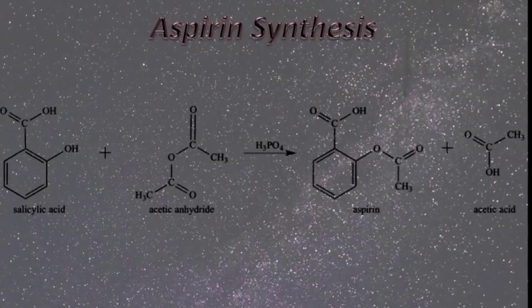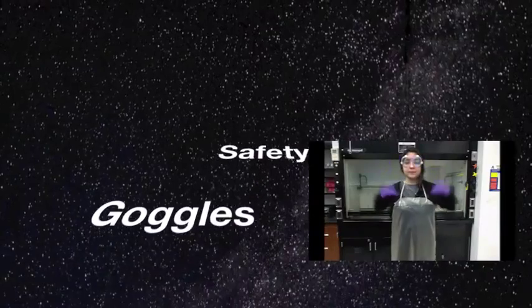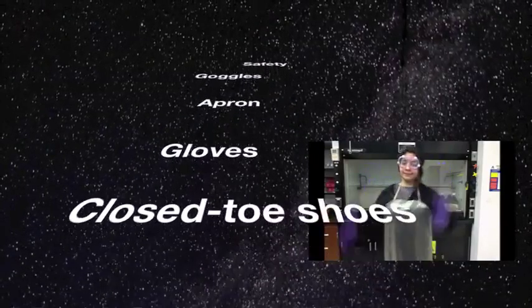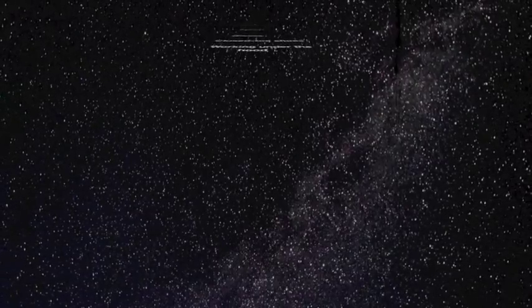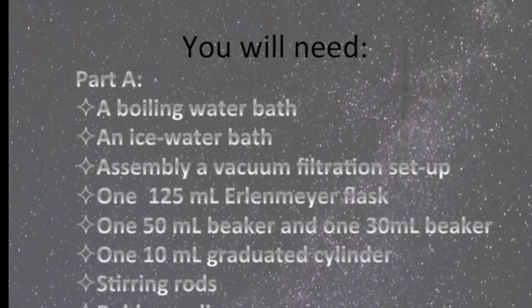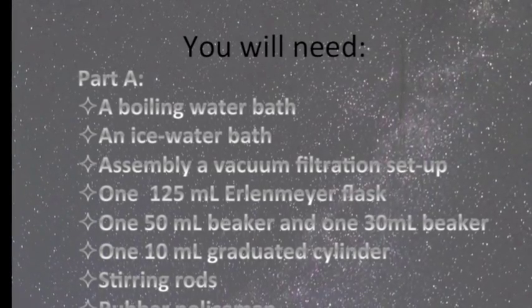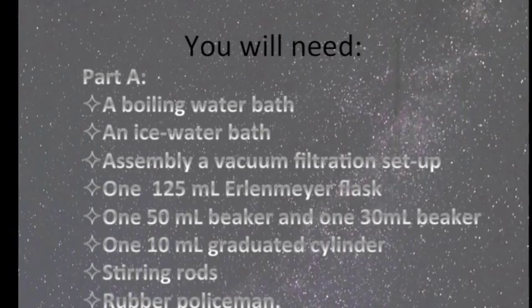The estimated time of completion is 2 hours. As always, make sure to comply with all safety regulations. There are two basic parts to this experiment. Part A is aspirin synthesis, and Part B is testing of the aspirin.